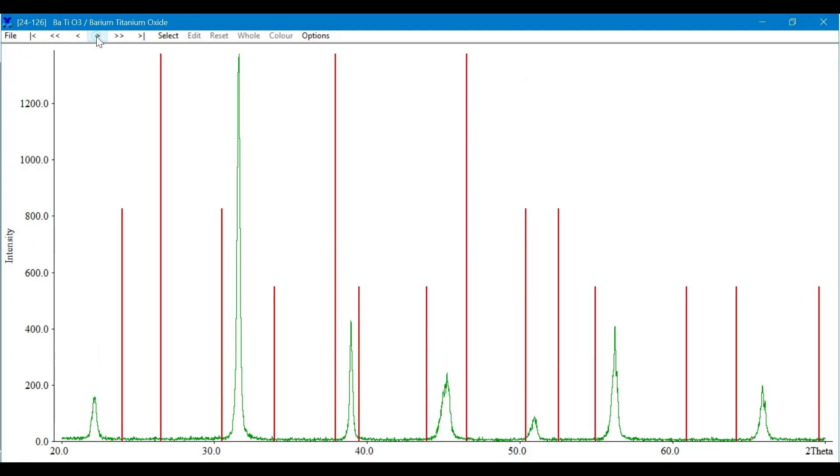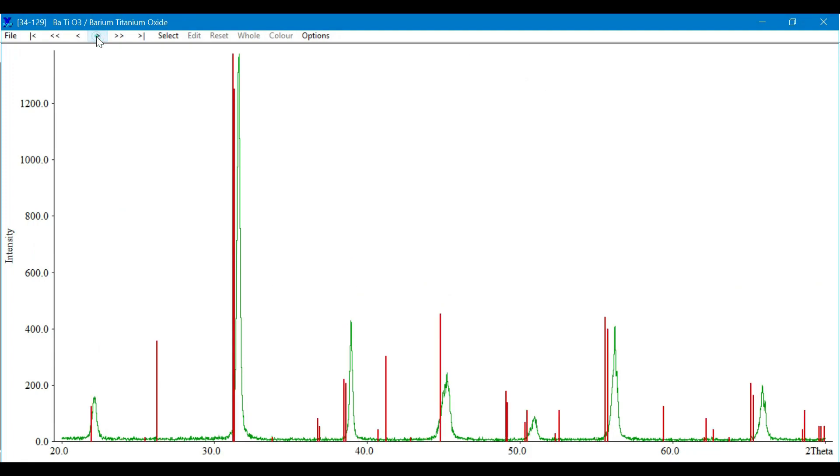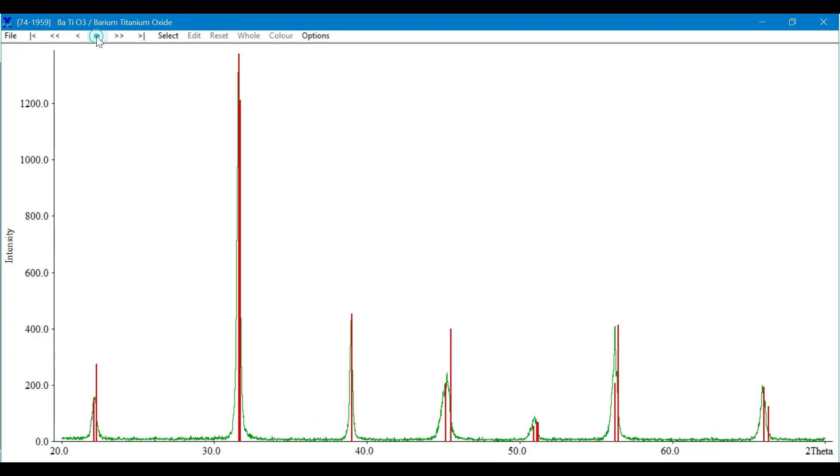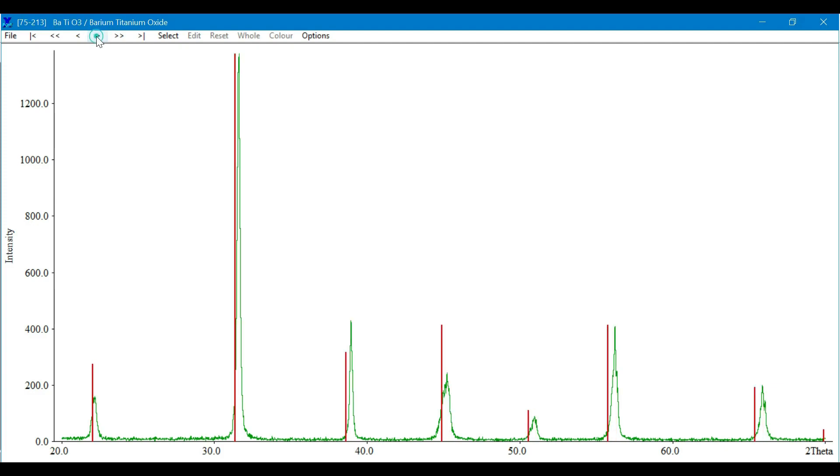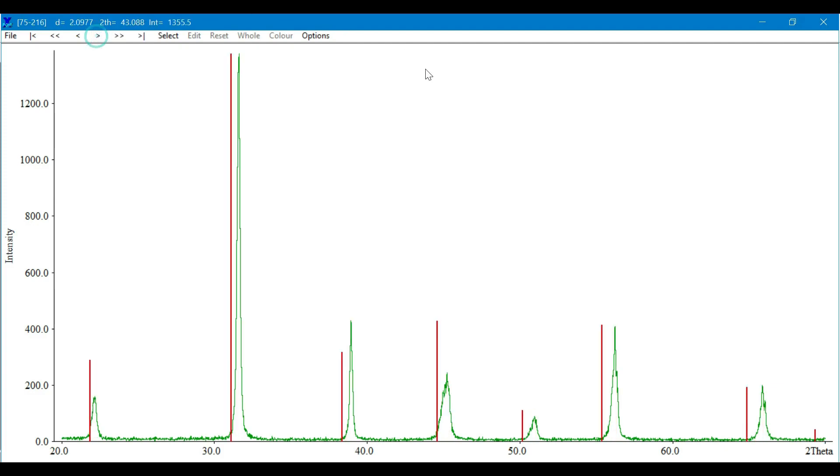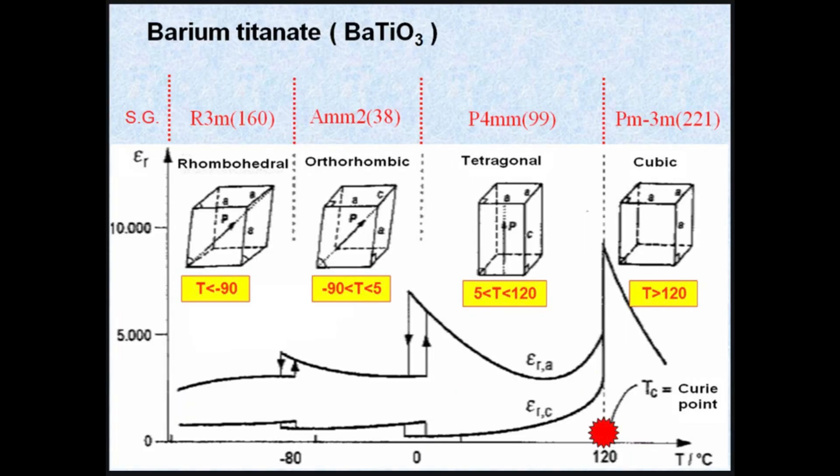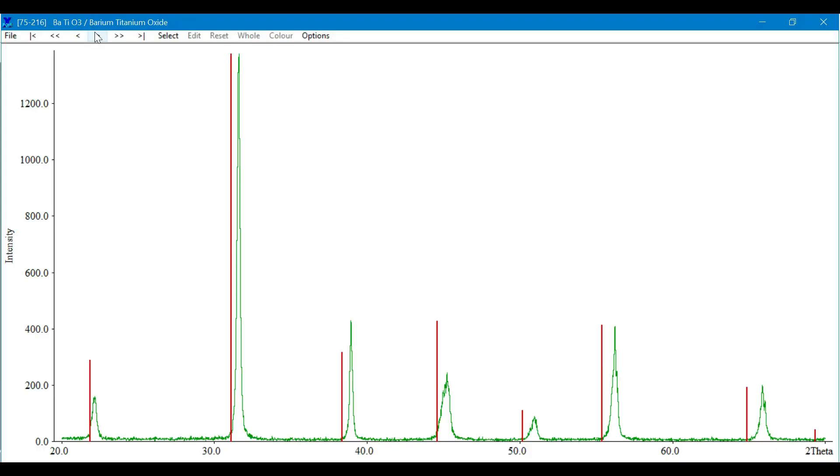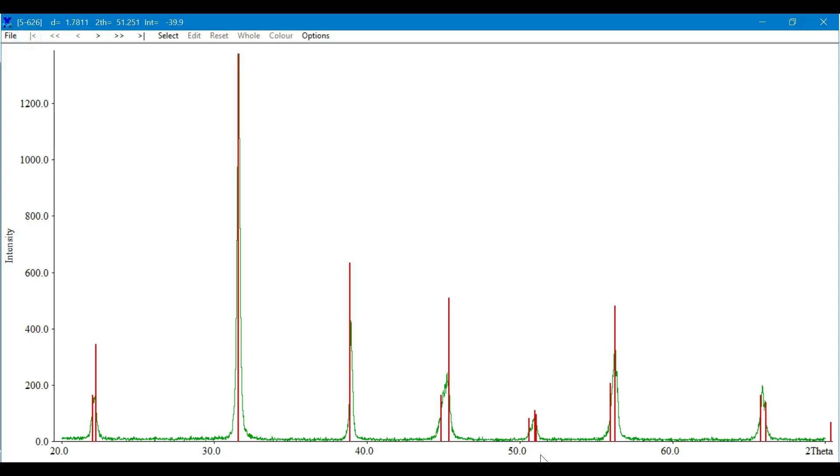In this case, I have searched for barium titanate. Different PDF cards are listed here, and most of them are different from each other because barium titanate has different crystal structures at different temperatures. You have to compare it with your required phase. For example, if you collected your data at room temperature, barium titanate has a tetragonal structure and will be matched with that specific card number.